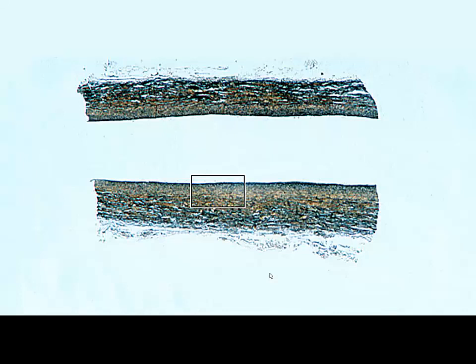Again, using this stain to look at the different layers, and it's difficult to see, so we're going to look at the inset here. And here we have the inset. Once again, we have lumen, tunica media, and then we have relatively thick tunica adventitia. And remember, for our veins, that's where we're typically going to see the thickest layer being the adventitia. So even just looking at this, we want to suspect that we're looking at the wall of a vein.